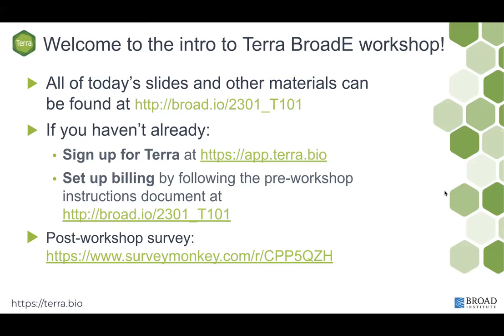Okay, so welcome to the intro to Terra workshop. All of today's slides are available at this Broad.io public-facing folder. So you can go ahead and type in broad.io/2301_T101 into your browser. And from then on, you don't have to type in any more URLs because you can open all of these slides on your own computer, and all of these links are clickable.